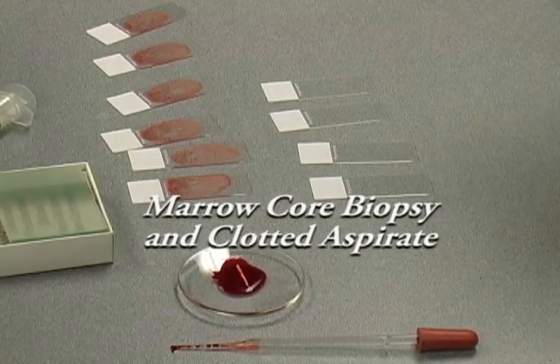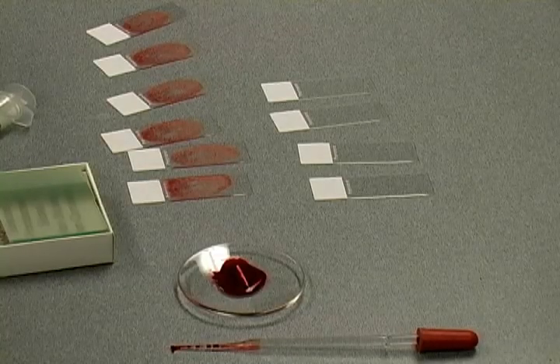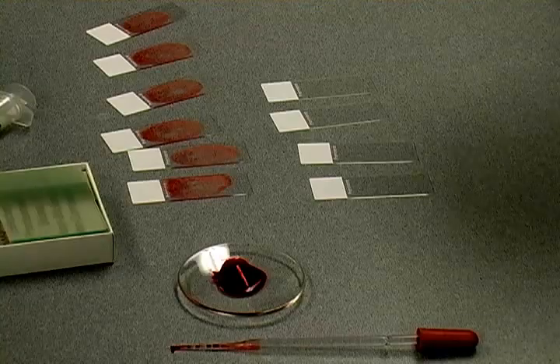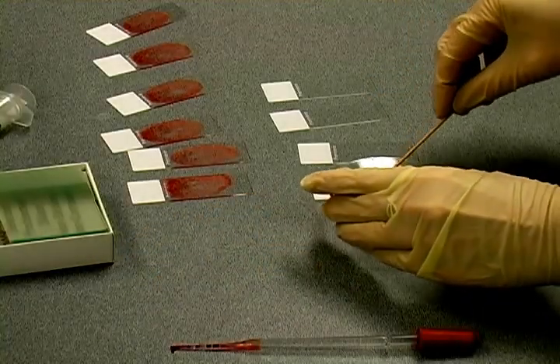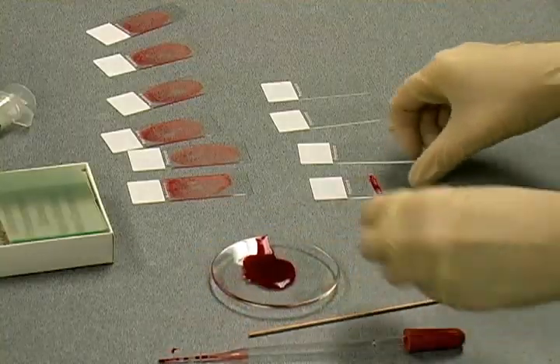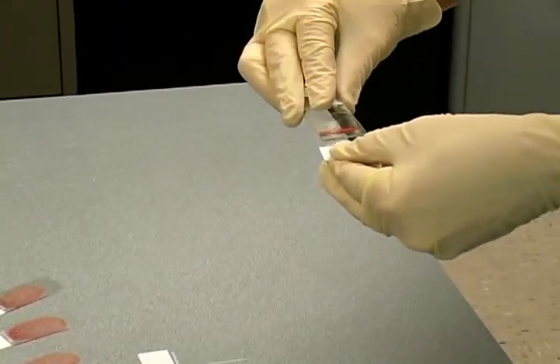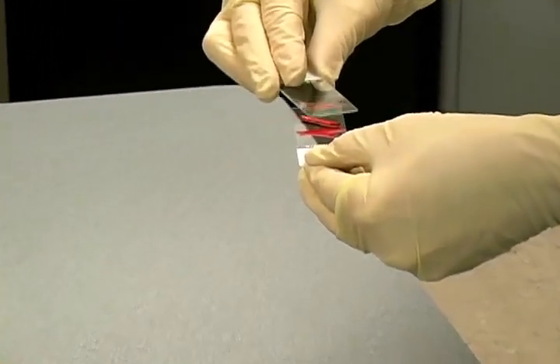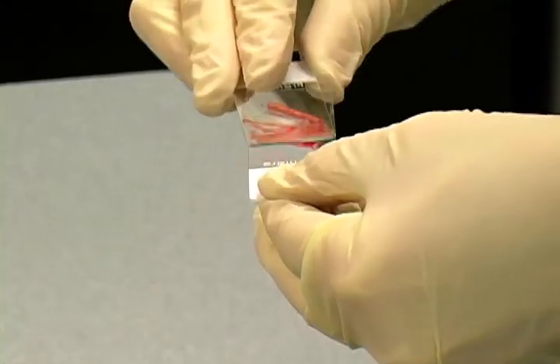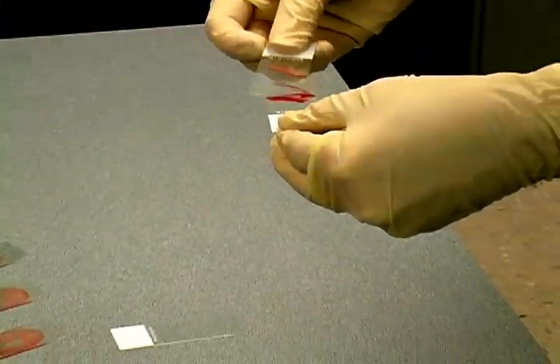Touch imprints are an often forgotten but essential part of bone marrow histopathologic diagnosis. These are primarily used by the hematopathologist as a backup for poor or dilute marrow smear preparations, either due to dry tap or smear mishandling. The fresh marrow core biopsy is placed directly from the Jamshidi biopsy tool onto a glass slide. Another slide is then gently touched to the bone core several times, imprinting cells from the core onto that slide. The imprints are then air dried completely and sent to ProPath for staining.